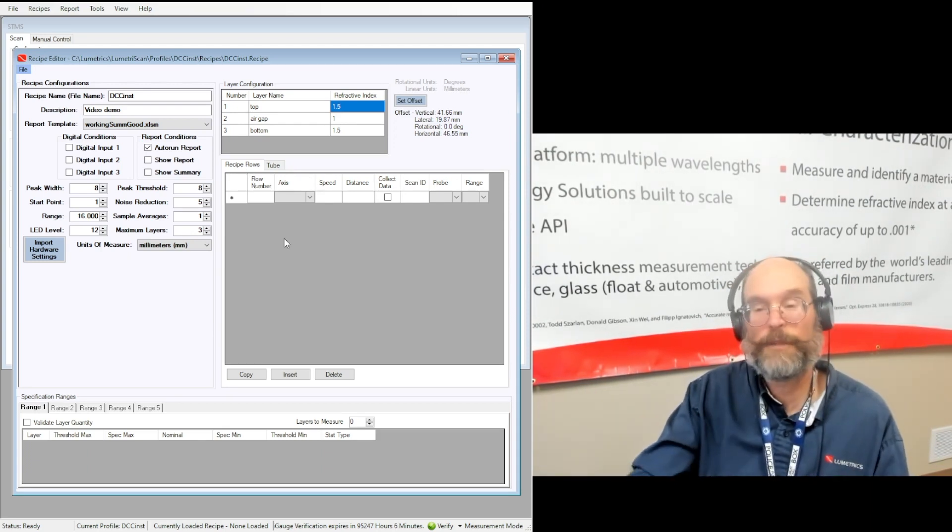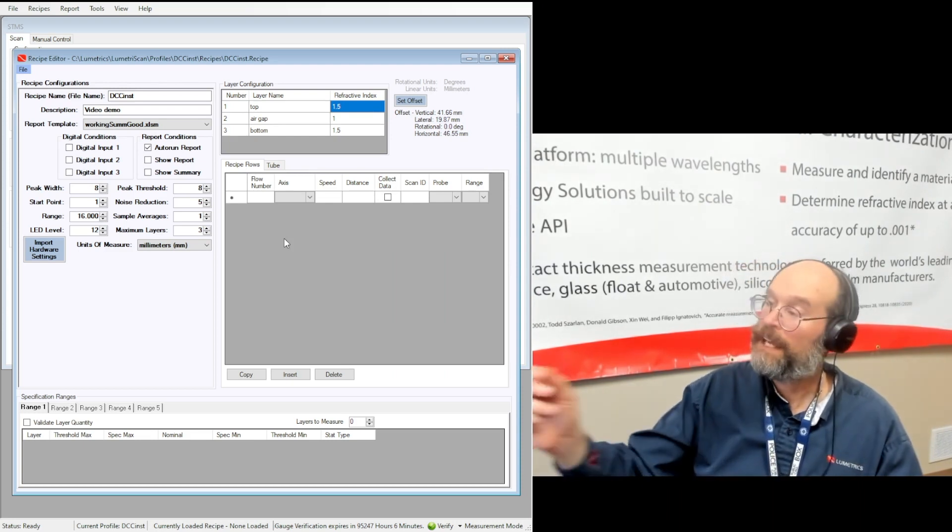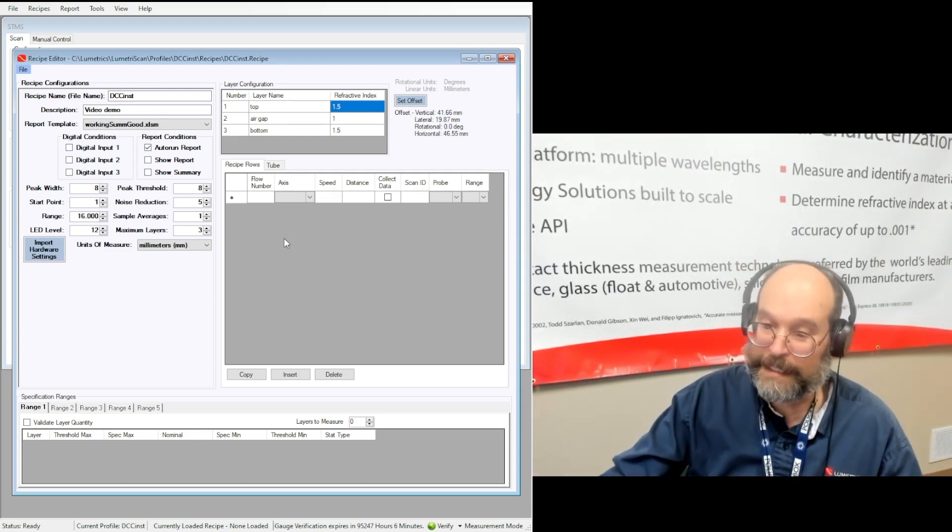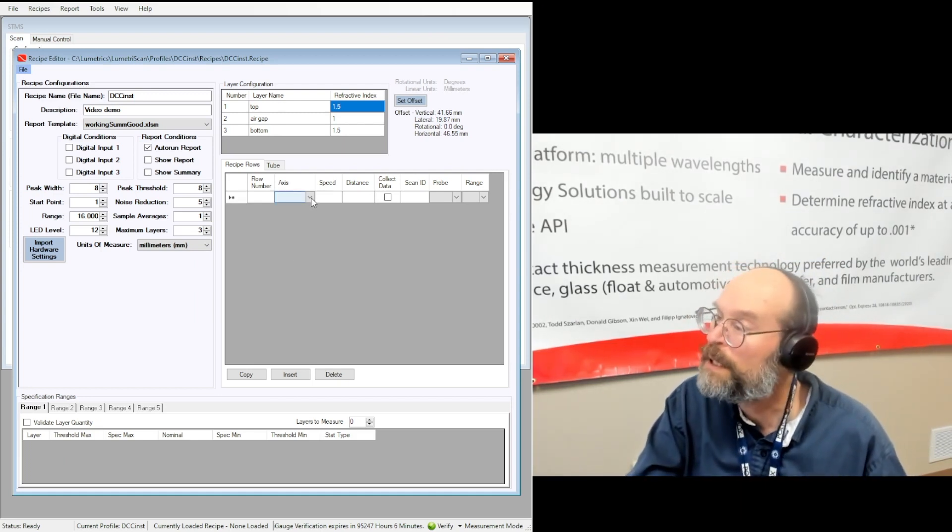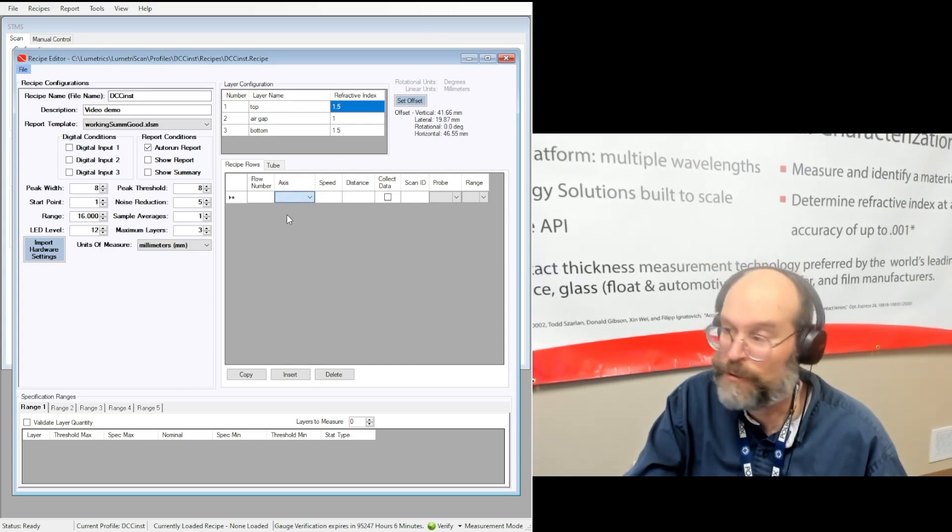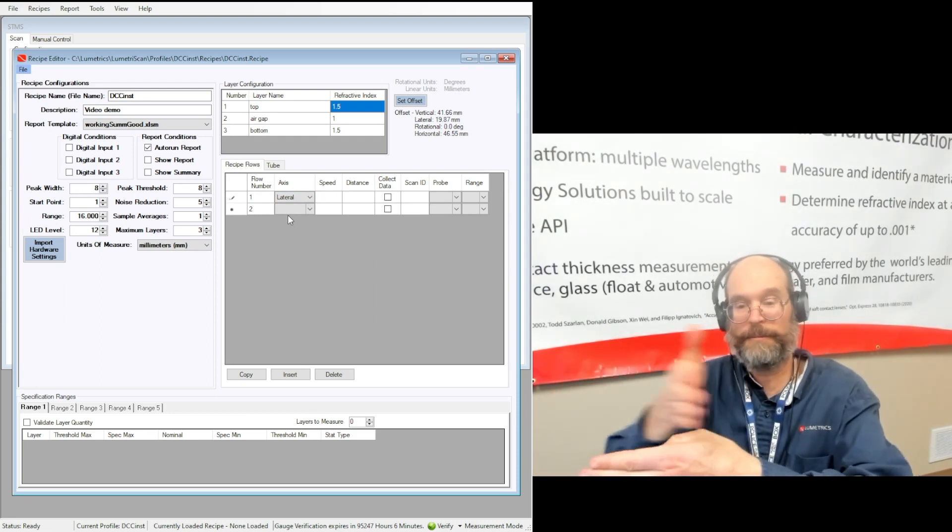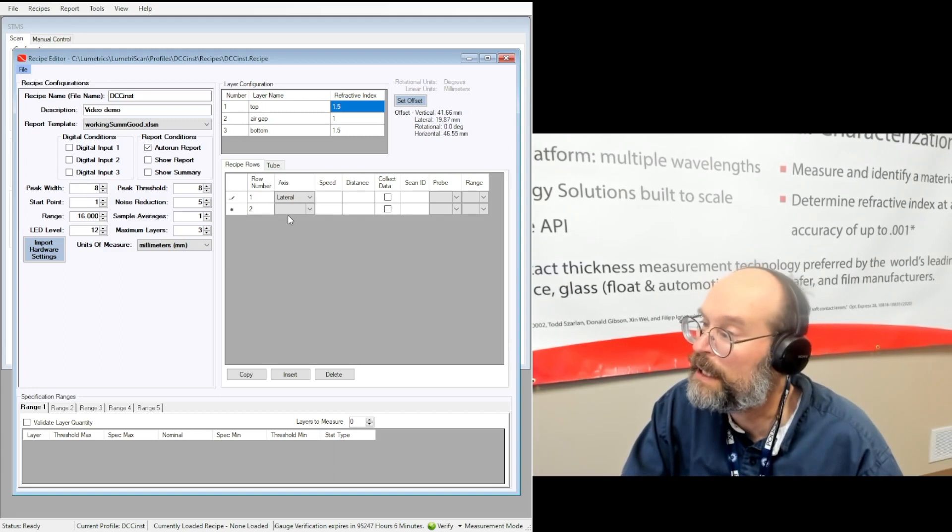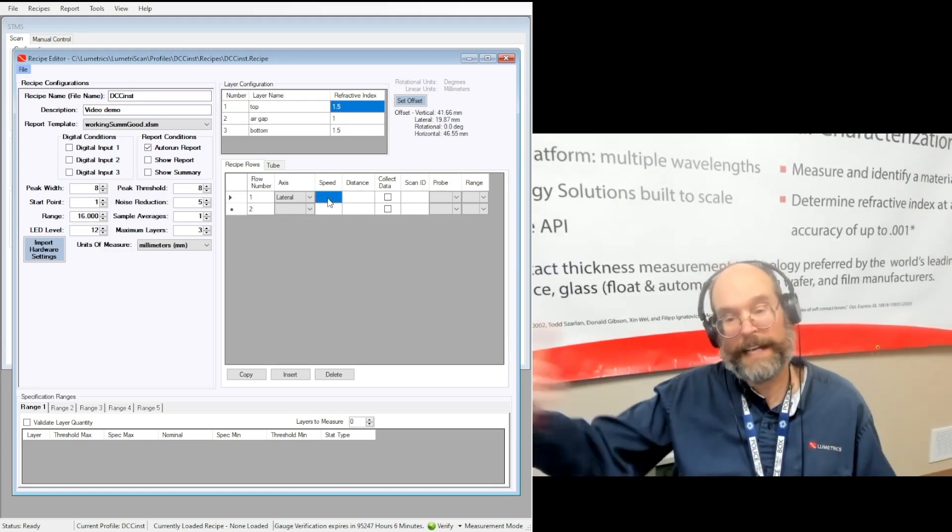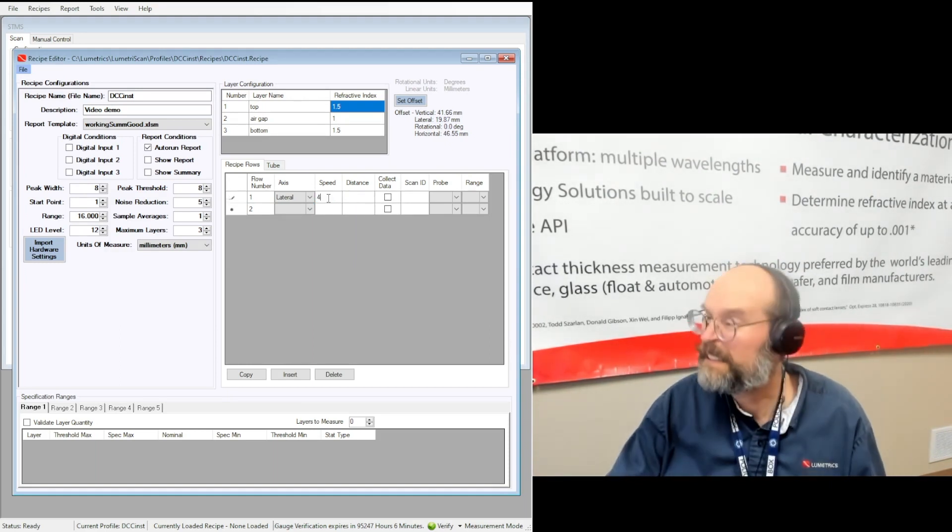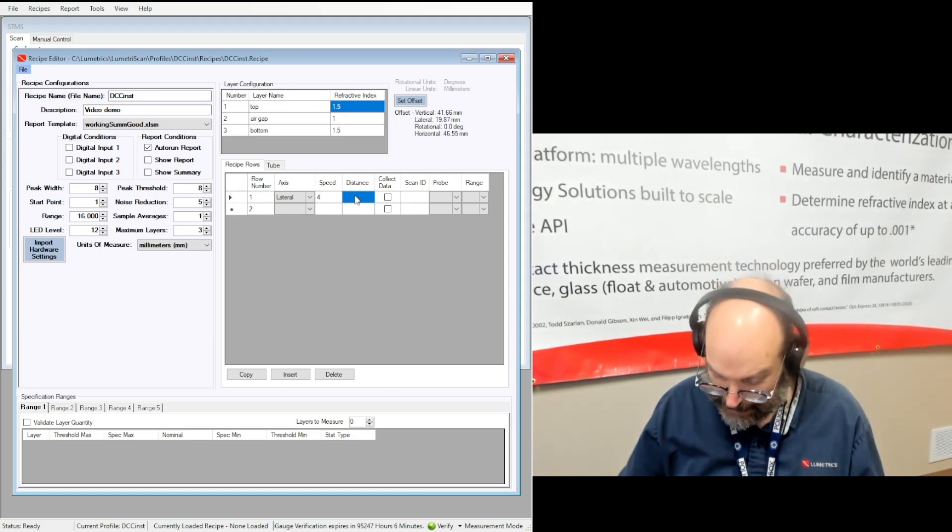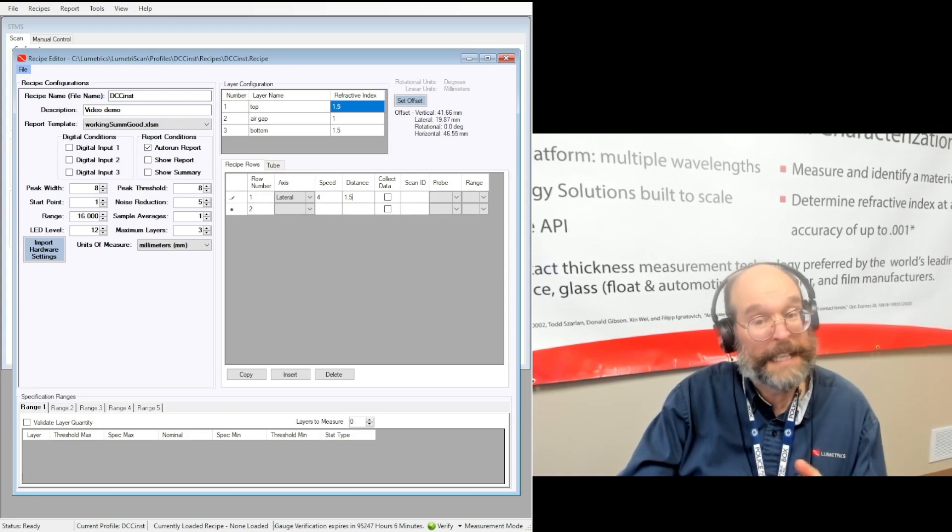In the recipe rows, you're going to add movements to the stages, and you're going to tell it whether or not to collect data during those movements. So for example, if you're scanning a tube, you usually start with a lateral move, right? So lateral is perpendicular to the tube. And you go ahead and what I do is I move half the scan over, and I do that relatively quickly. So 4 millimeters per second and a distance of 1.5 millimeters because I'll do a 3 millimeter scan.